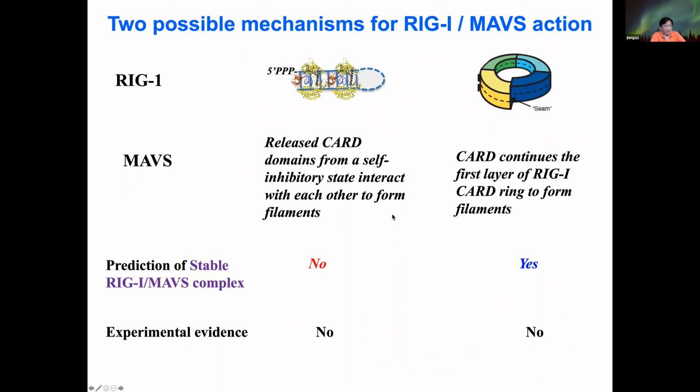So what's the real difference? The question is which one is really physiological, or whether both are physiological. We still have no firm conclusion yet, but in the literature there is some data based on the C1 symmetry on the right side.